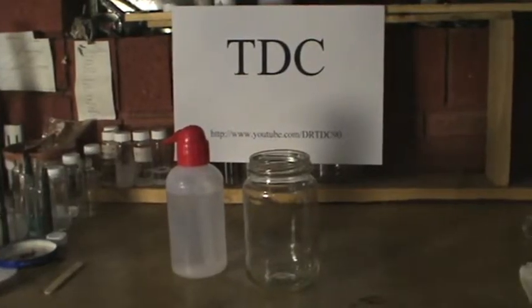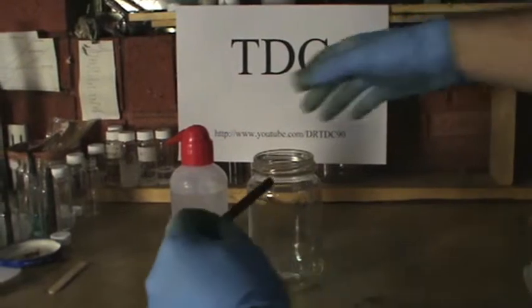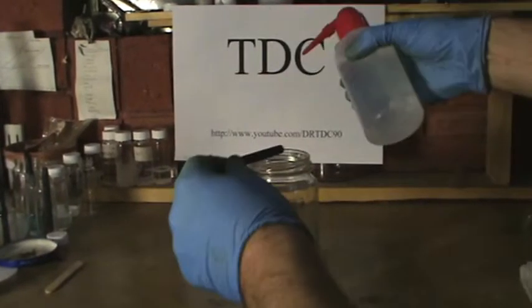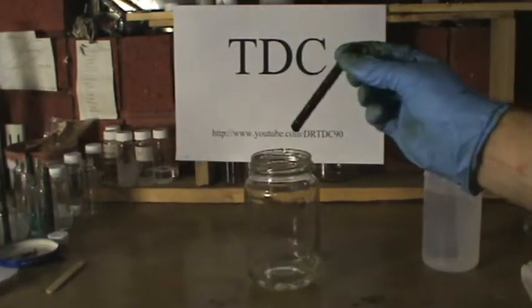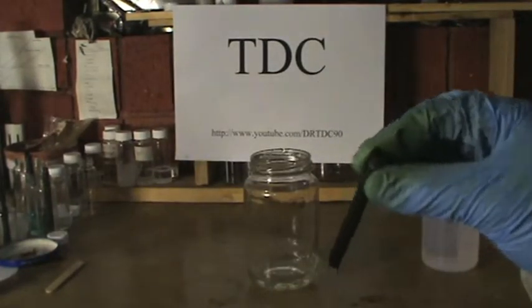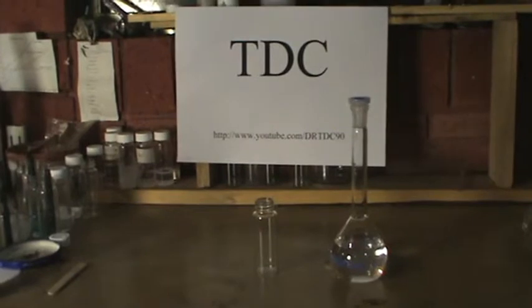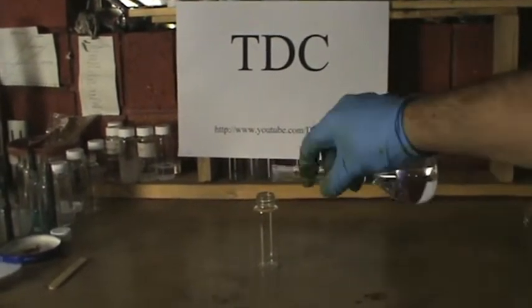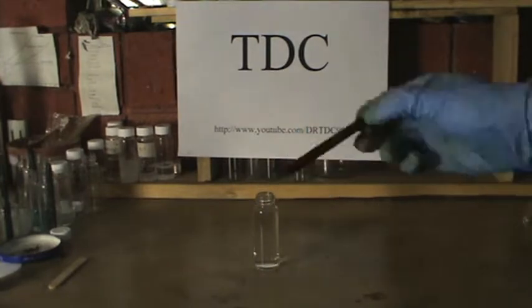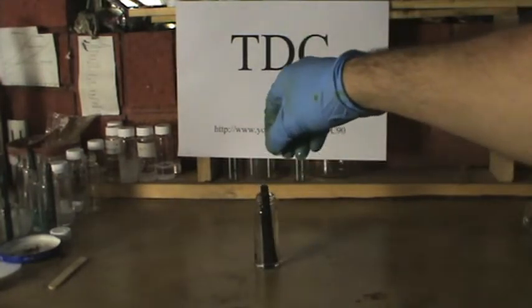After 30 minutes, turn the power off and remove the cleaned graphite electrode and rinse with milli-Q water. Following the rinse with milli-Q water, dip the graphite electrode in a 10% volume per volume nitric acid solution for 10 minutes.